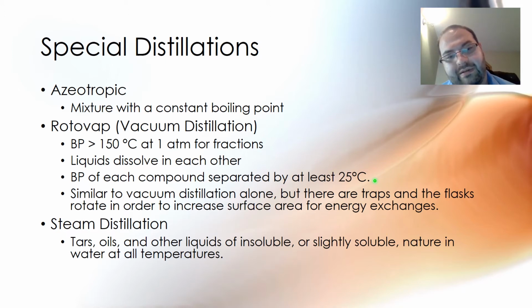The coil lets water run through it. The cold finger, you can put ice in it, ice water, ice and salt to make it even colder, acetone liquid nitrogen slushes, CO2 in the form of dry ice mixed with acetone or other types of solvents depending on what you want to achieve.